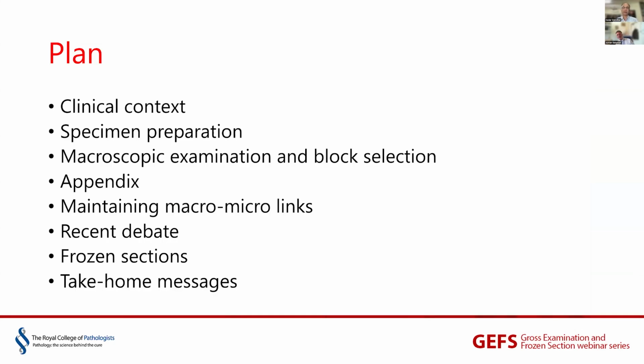So I know that colorectal cancer resection specimens are, of course, commonly received in many parts of the world. That will be something that people will often see in their cut-up. I'm sure many people on this webinar will have plenty of experience of dealing with them, but I hope that I can still provide some useful tips for you.